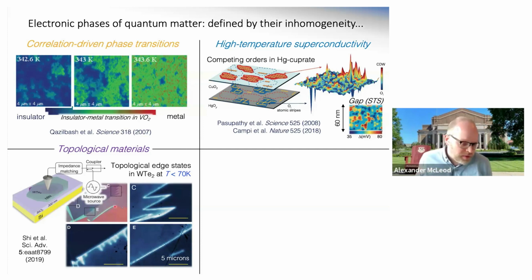And when it comes to these topological materials, what makes them special is these electronic states that exist only at the surface. So if you take a two-dimensional crystal, that's a topological insulator crystal. The special thing about this crystal is the electronic states at the boundary, right at the edge of the crystal. By using scanning probe techniques, it's possible to actually visualize these electronic states at the edges. And that's what these bright regions show. This is the measurement of the conductivity associated with these edge states in what would otherwise be an insulating crystal.